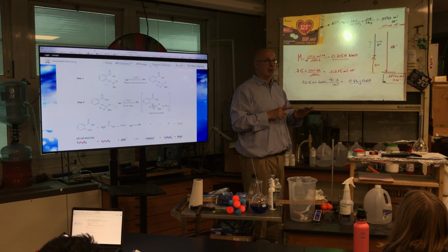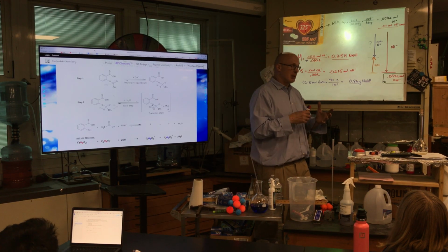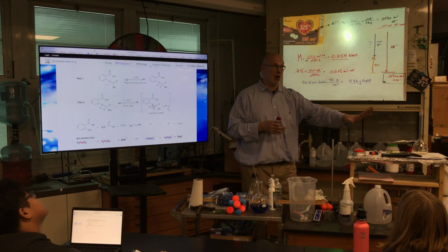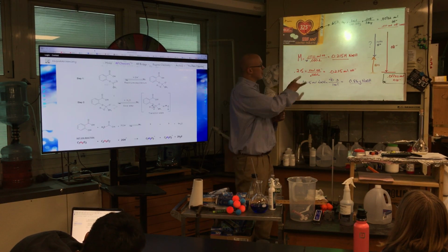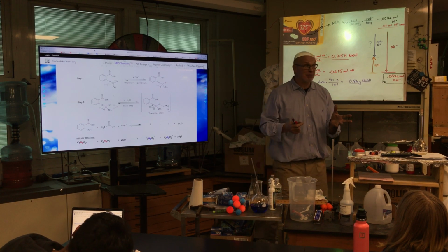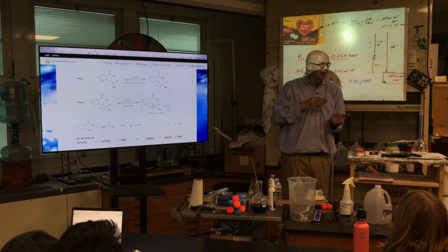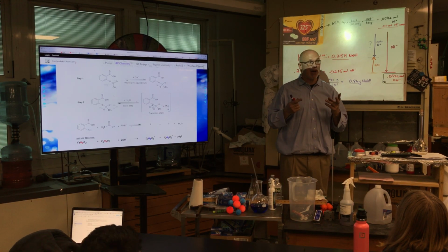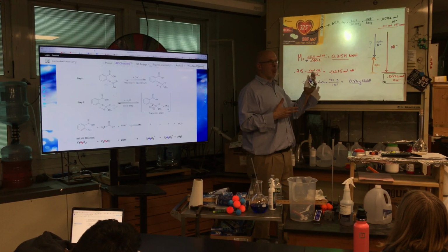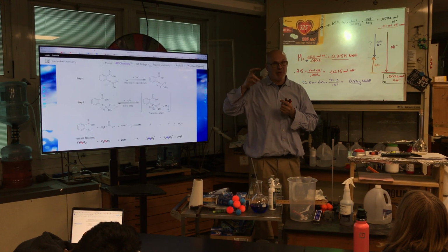Let's figure out the KHP standardization, because I really have to know what this concentration is. So, we gave ourselves 20 milliliters to play with, but I would design the titration for KHP to be 20 milliliters, correct? I'm gonna say 10. This is an arbitrary value. So I wanna put, of the 20, maybe 15 in my burette. The other 5, I'm gonna rinse the burette.